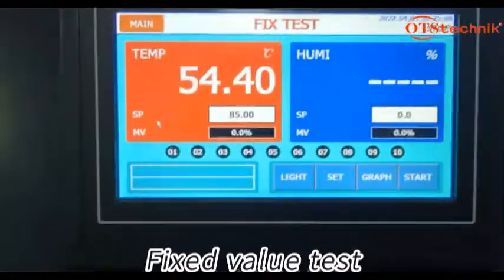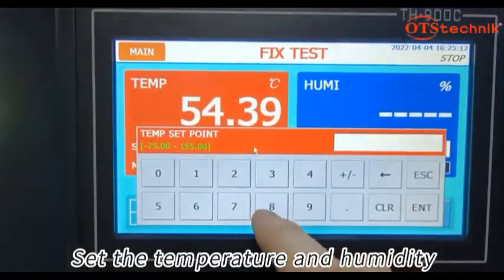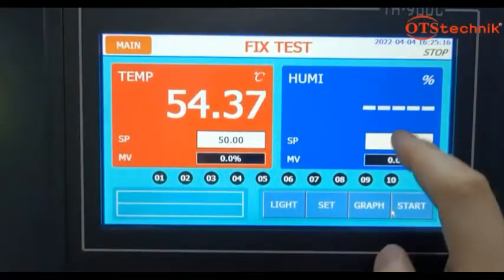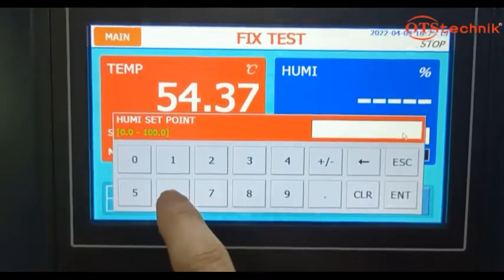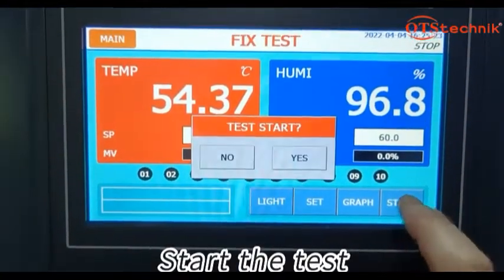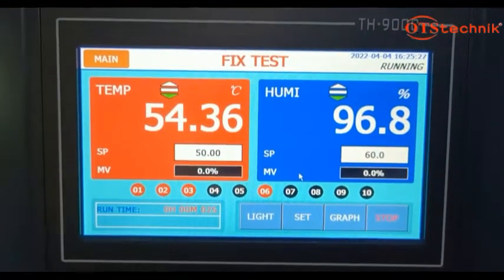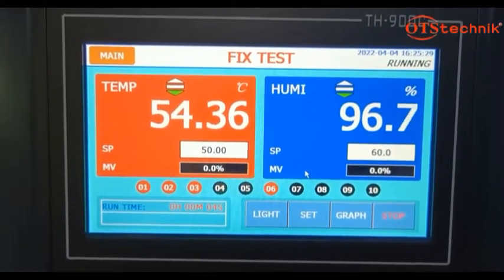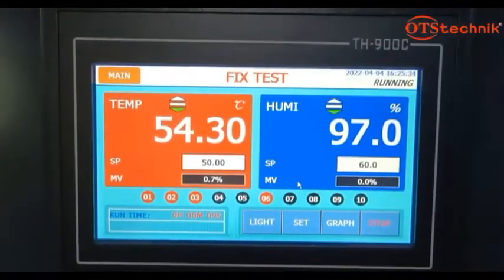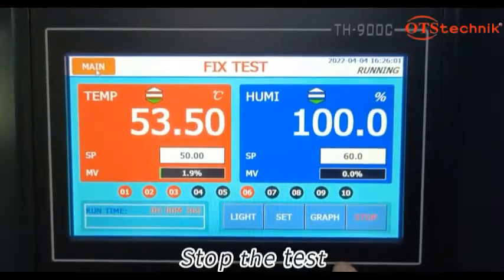Fix the value test. Set the temperature and humidity. Start the test. Stop the test.